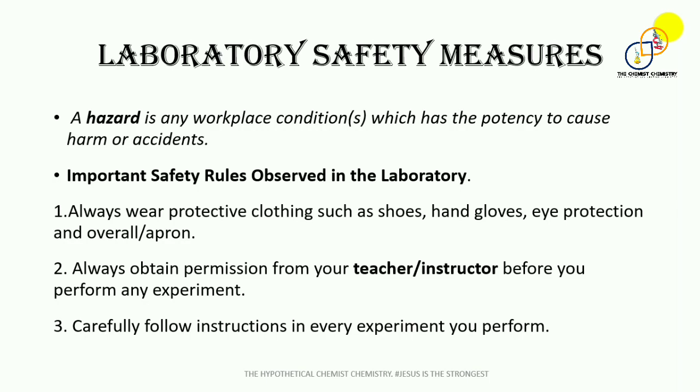Now, the first thing that I want us to talk about is hazard. Hazard is any workplace condition which has the potency to cause harm or accident. So anything that can cause accident at your workplace, and here specifically in the laboratory, is termed as hazard.